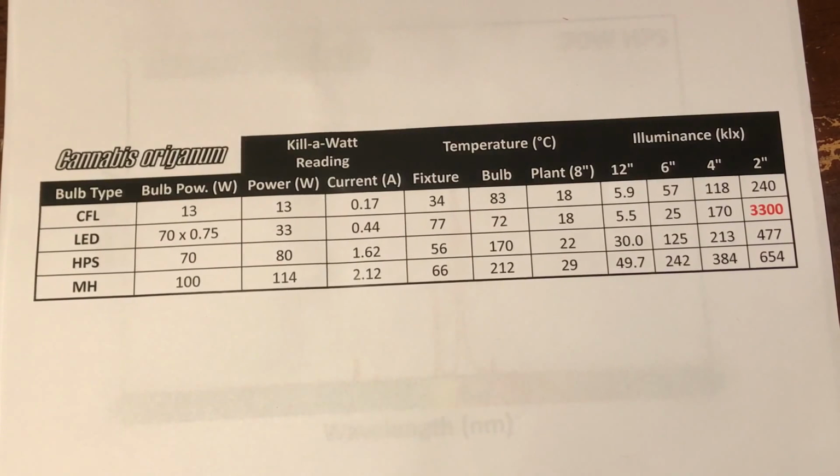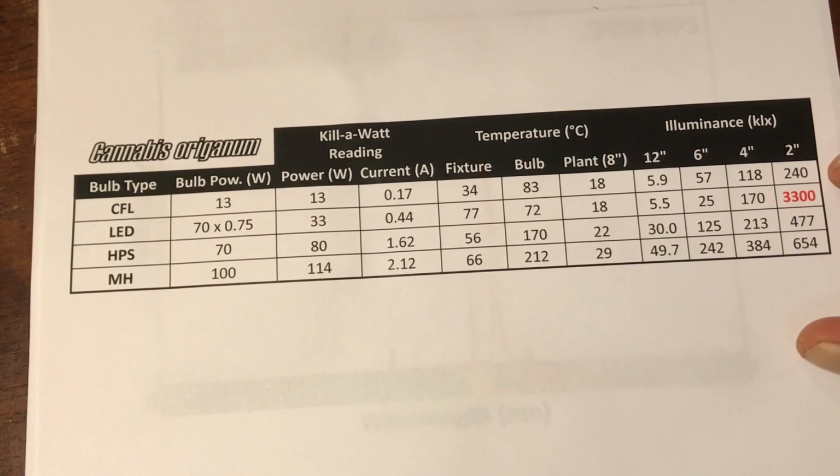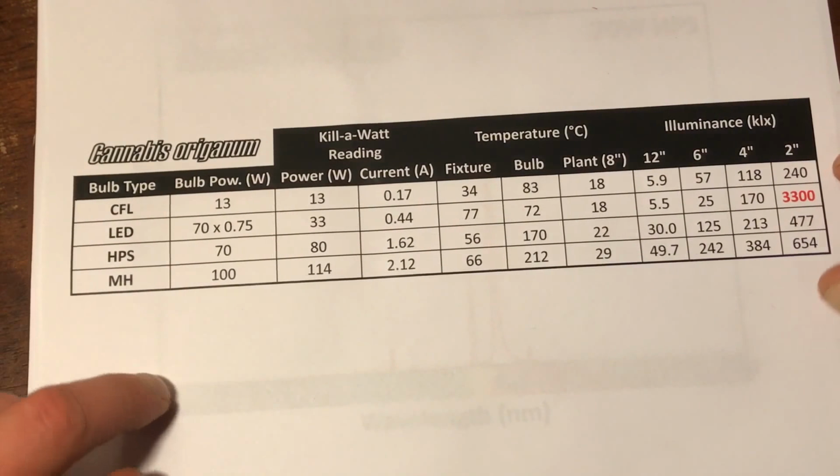But basically, all it is, is a detector that measures light intensity at individual wavelengths. And the one I'm using is going from 200 nanometers to about 1200 nanometers detection. So that's from UVB or UVC to the mid-IR range, or near IR kind of area. And so let's take a look at the results of measuring these exact fixtures. I'm not looking up these fixtures.